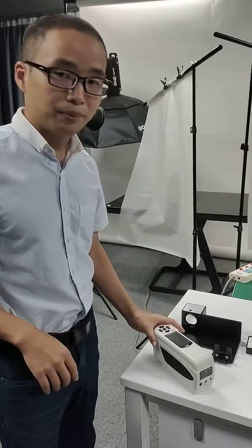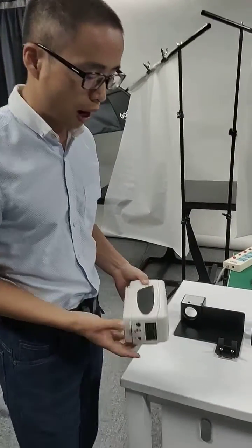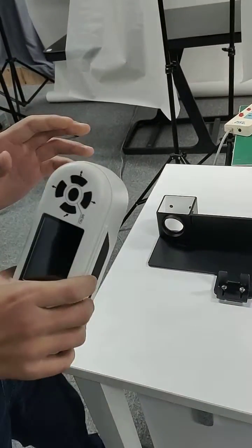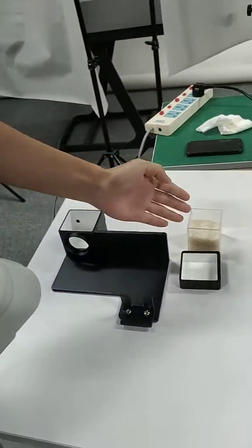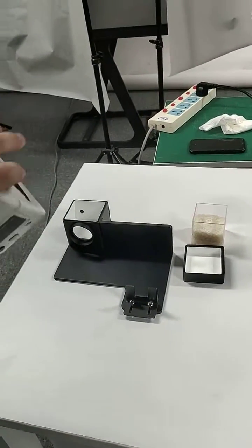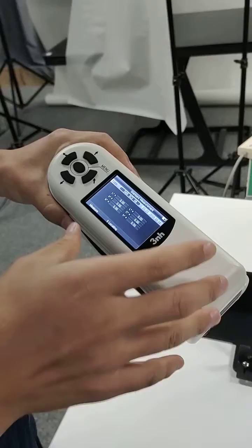Hello, here I'm going to show you how to use our NH colorimeter to mirror the color of powder and liquid. First, we calibrate the instrument.